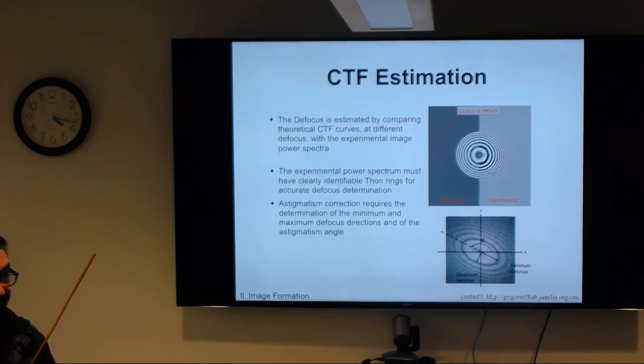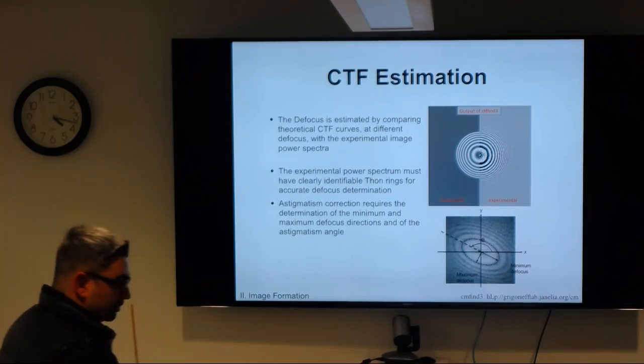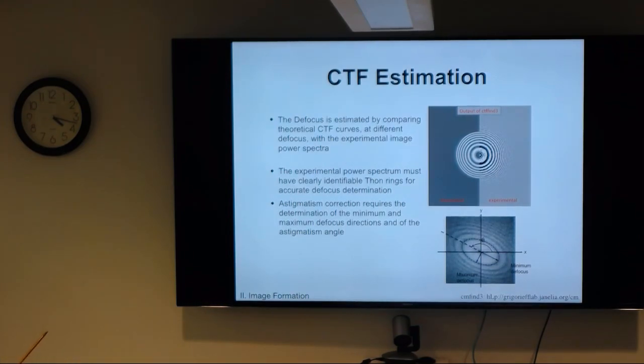Any other questions? And this is a good point, this lecture is very dense. The videos themselves are fantastic, but also very dense. So to try to give it more practical application, you do the CTF fit, and it'll give you a resolution for your image. Basically, you've got Thon rings out to about this far. You've got information to this resolution in your micrograph.